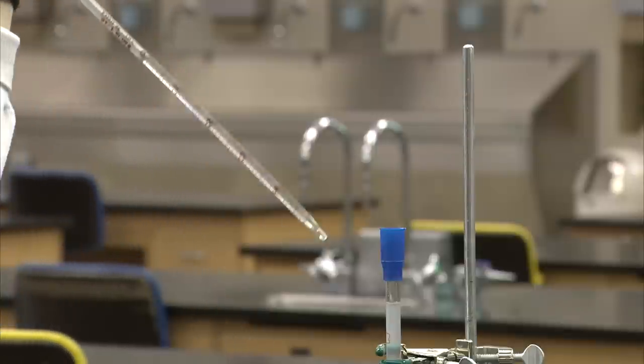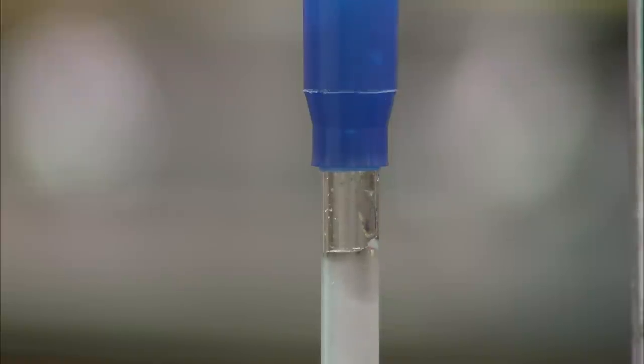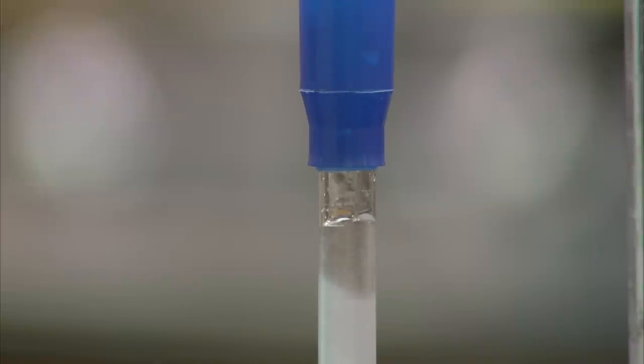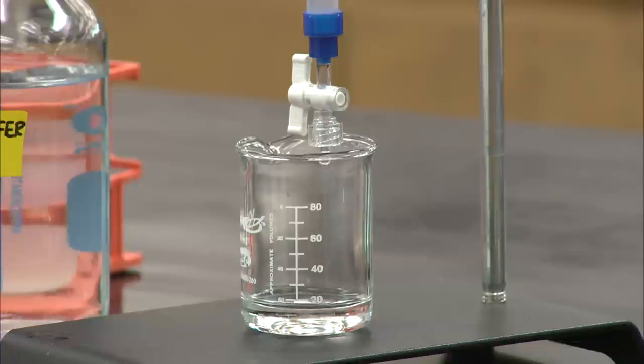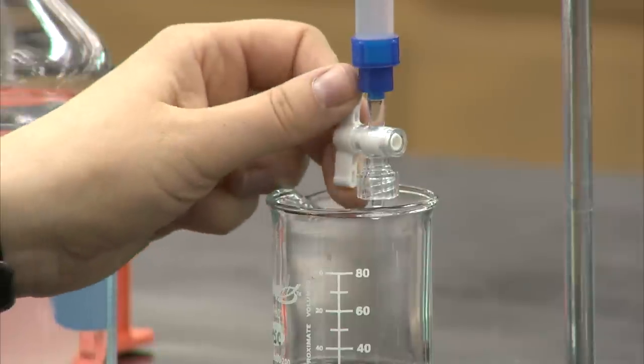To add buffer, while being careful not to disturb the gel, use a pipette to pour it down the side of the column. Once this additional buffer has flowed through and the meniscus has reached the top of the gel bed, close the stopcock as the column is ready to be loaded.